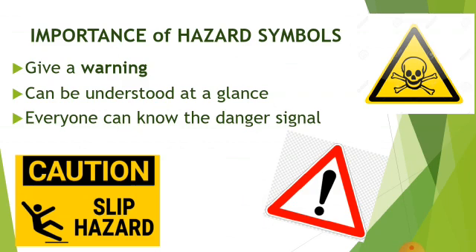Importance of hazard symbols. These symbols are very important. Why? Because they give a warning. Warning. There is some danger. It can be understood at a glance. We don't need to study 2 to 3 lines. We don't need to read. We just have a click on it at a glance. We can understand this. Everyone can know the danger signal as they are internationally accepted. So everyone can know. Even if a person cannot read, he or she can understand the symbol and can know the danger.